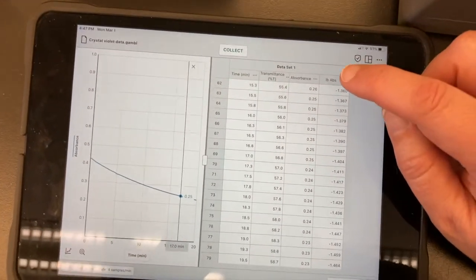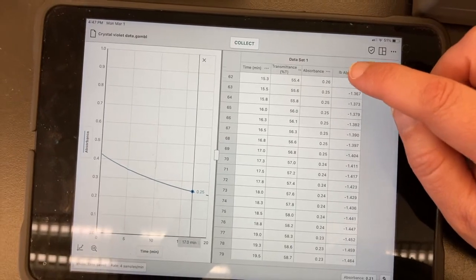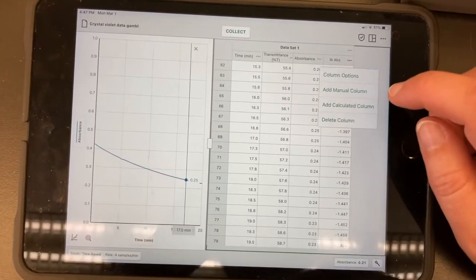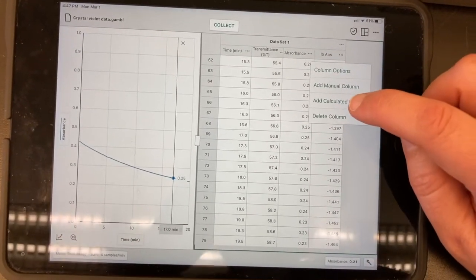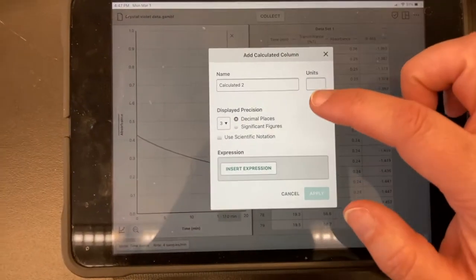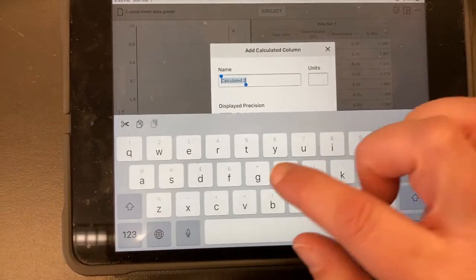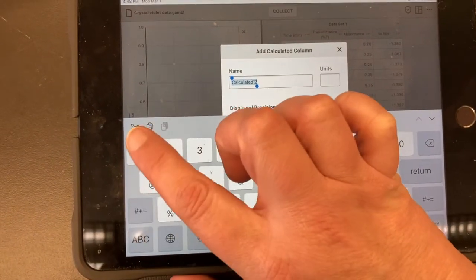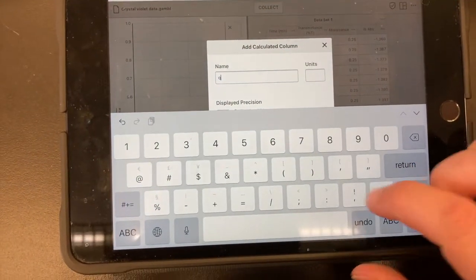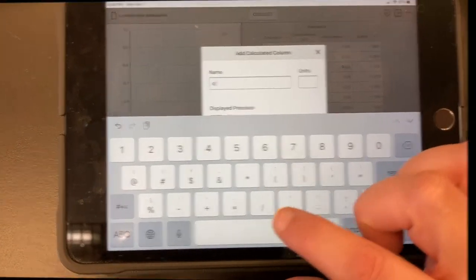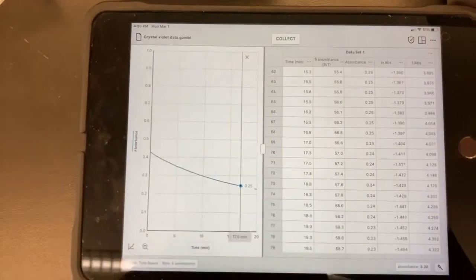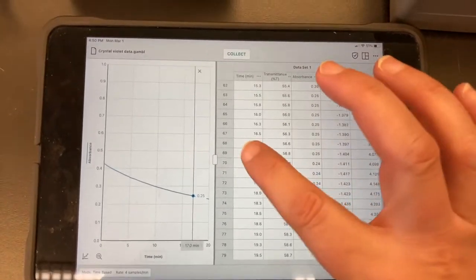And then our second order test is one over the concentration. So we are going to do one over the absorbance. So again, we are going to add a calculated column. And we are going to change the name of that. So you can call it one over absorbance or you can call it inverse absorbance. All right. So now we are going to look at the graph.